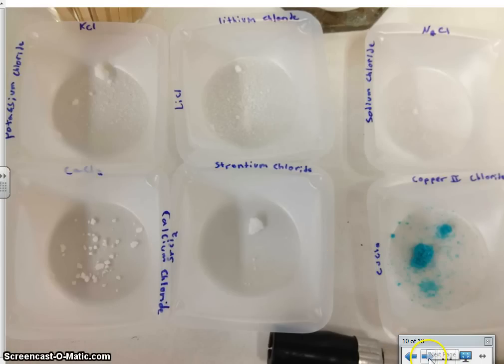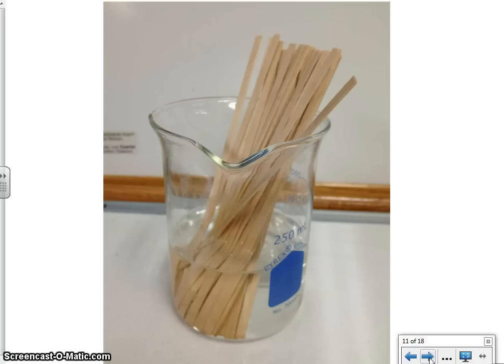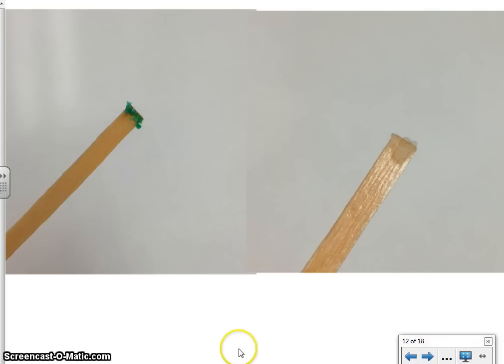And if they all have chloride, then we know that any color we see is not from the chloride, it's from the metal itself. You'll find some wooden splints soaking in some distilled water. You will need 7 of these. You'll use 1 for each of the substances that you are going to test. You only need a small amount of the substance on the tip of the soaked wooden splint. Okay, this that you see here, this is the copper 2 ion. This is plenty. You don't need any more than this. In fact, this is probably way more than you need. That one's pretty easily visible because it's bluish green.